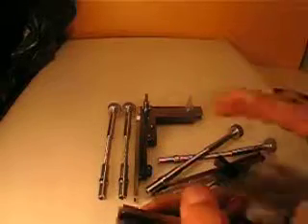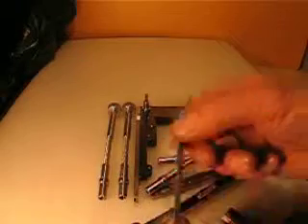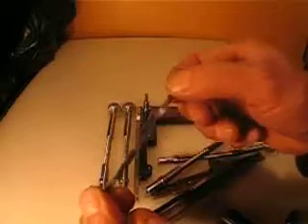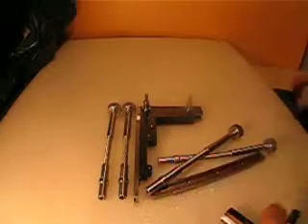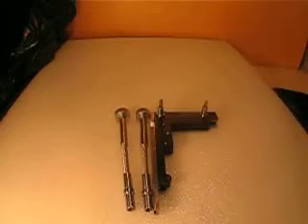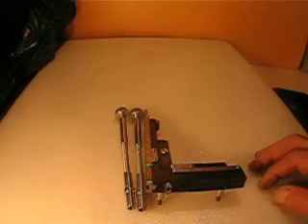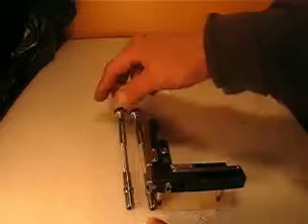So this is for extra parts, perhaps. This is the tiny pinion. I don't want to confuse you guys right now. I just want to focus on this one right here for $19.99. But just let me know if you are interested in the other parts and I can make a deal for you. I can sell the other things all separate for another $10.